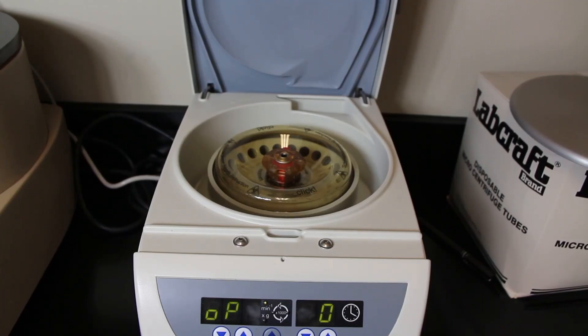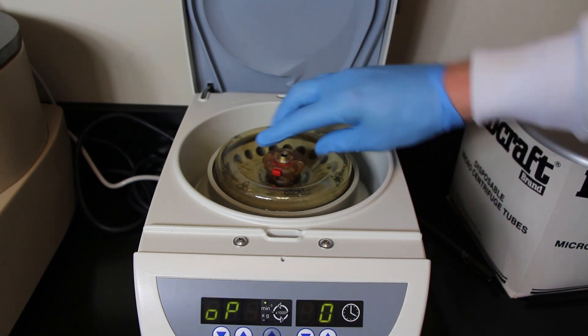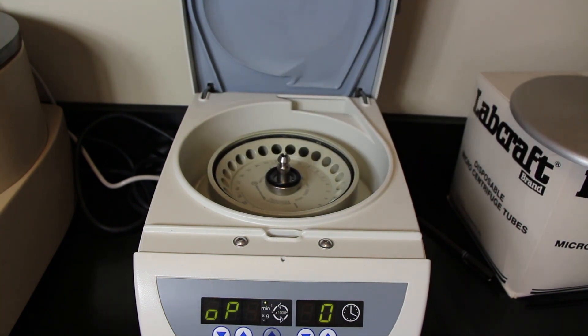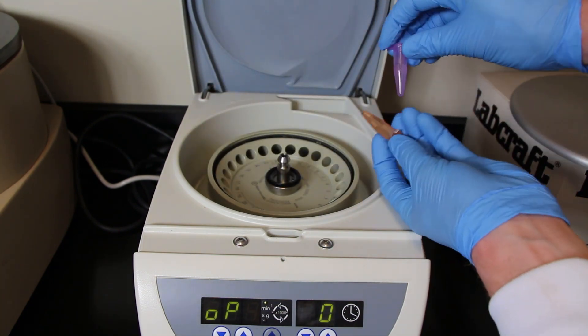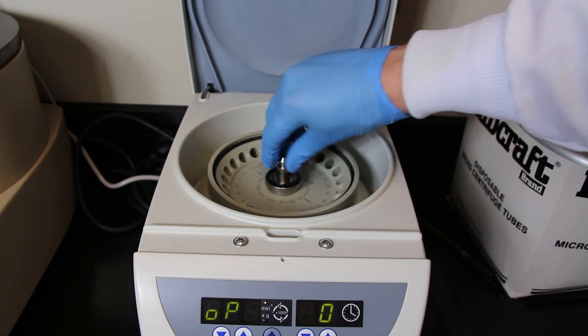For now we need to get that disc out so we can put the tubes in. Just push the little red button and pull it straight up, and then you can load the centrifuge. Take your tubes and put them in so that they are balanced to each other — put one over here, you have to put one on the opposite side. You don't want them next to each other with nothing on the other side. You want them to be balanced.